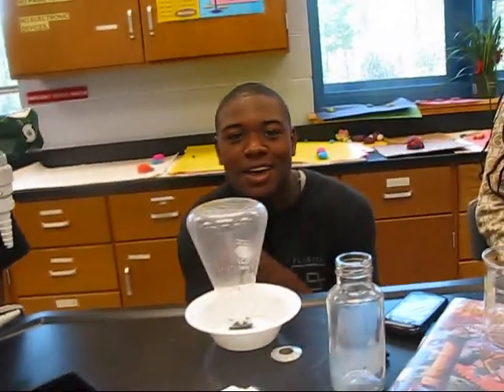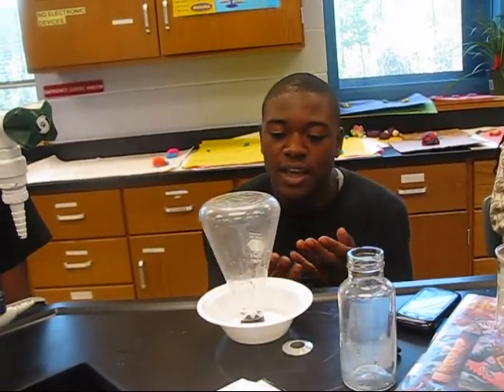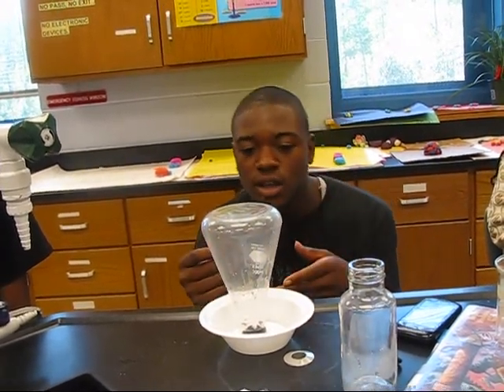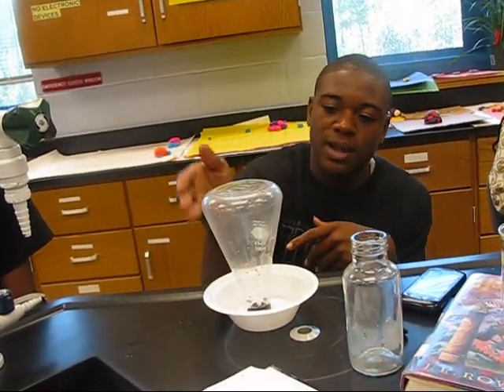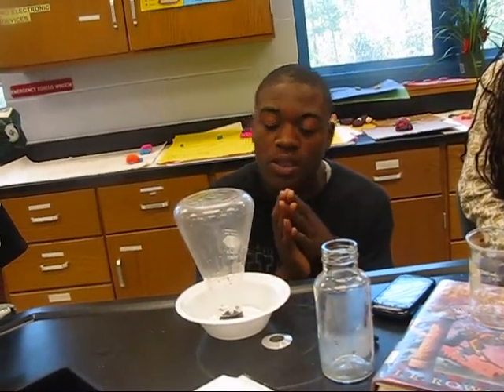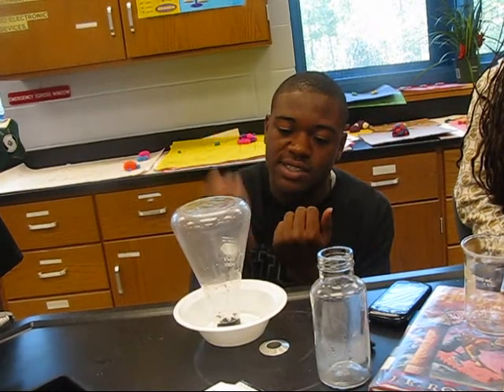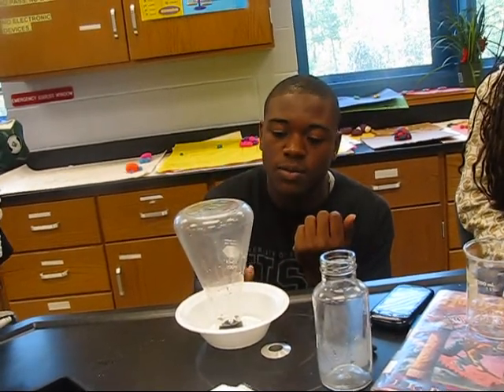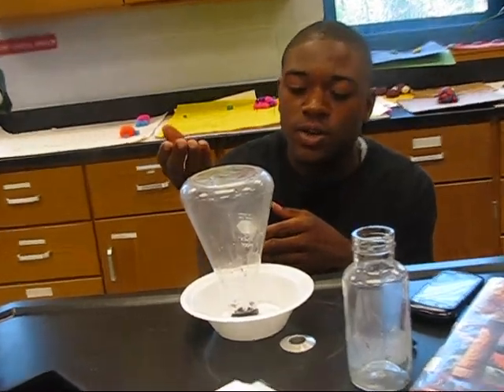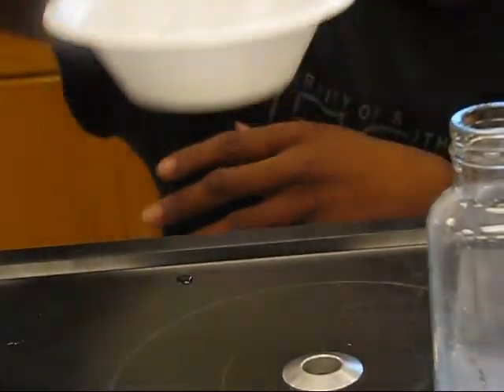First, you have to light the candle. And when you light the candle, the fire uses oxygen, and the oxygen around it creates a vacuum when you place the cylinder over it. And when all the air is sucked out of it, it creates a vacuum, which causes the water to seep up into the cylinder, which causes this effect.